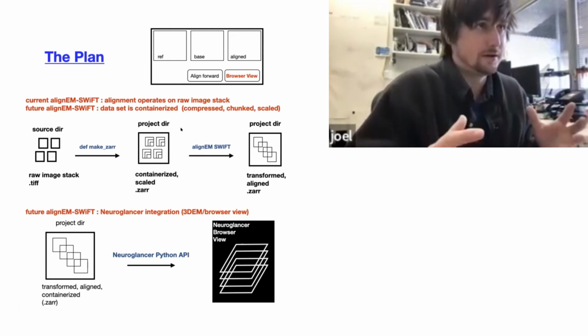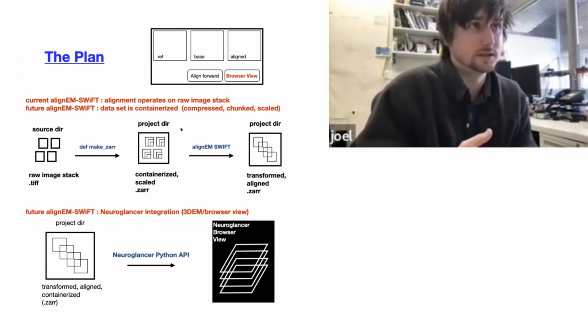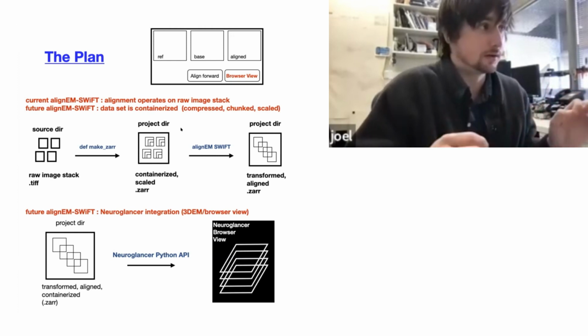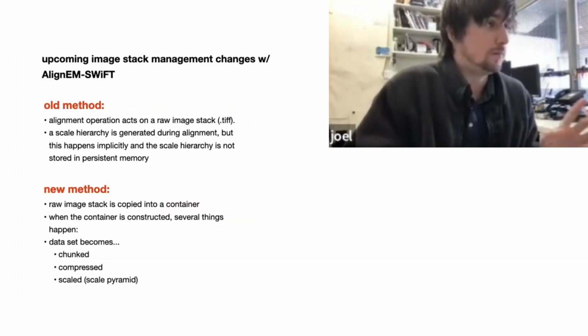So our plan is to have all of the images, as the very first step before alignment, put into a container. The container that we've been working with is a new technology called Zarr. I'll go back to that.